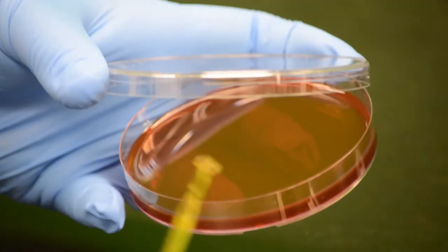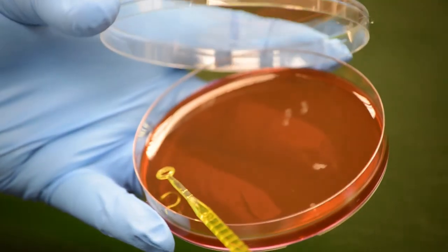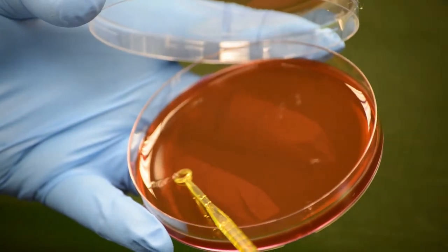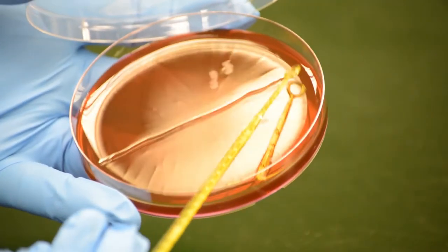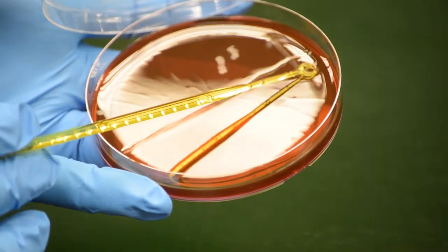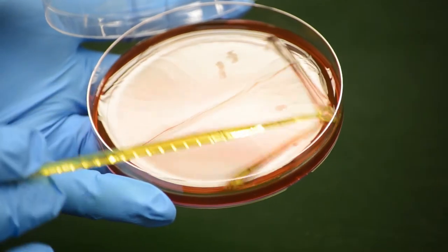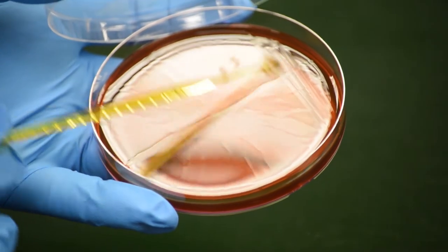The lid of the plate is opened and a vertical streak is made down the center of the plate. The loop should be touching flat on the agar so that a maximum of the fluid is transferred.